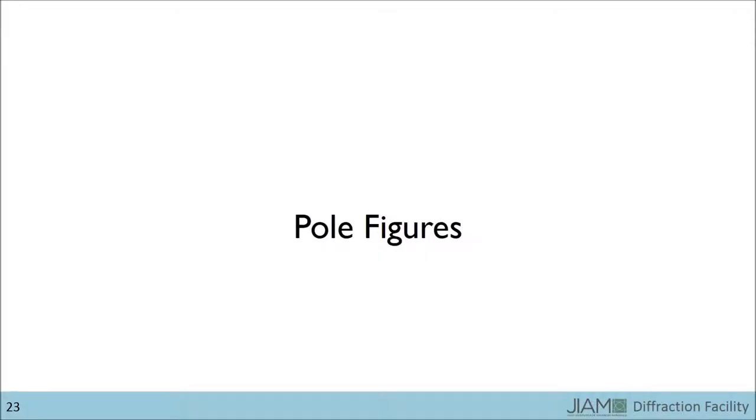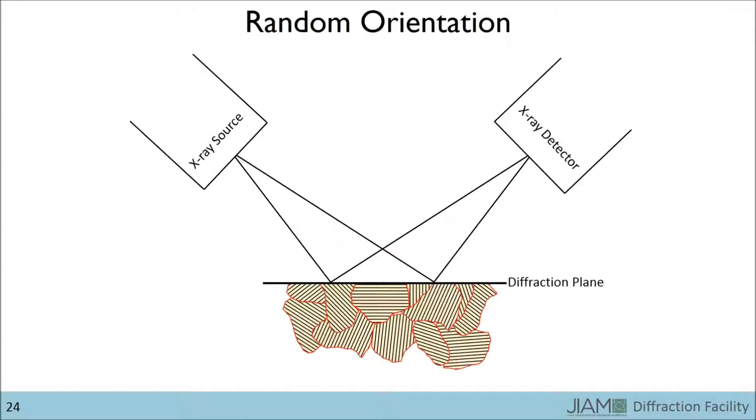The next technique works with solid pieces of material and thin films. However, to really understand what pole figures can tell you, we need to take a step back and look at the conditions for diffraction again. The diagram shown here is a more realistic representation of diffraction.